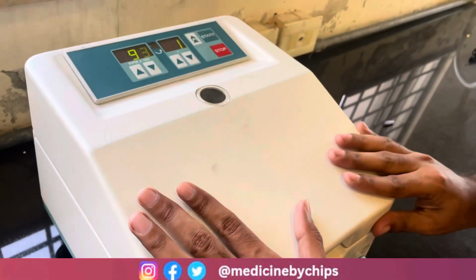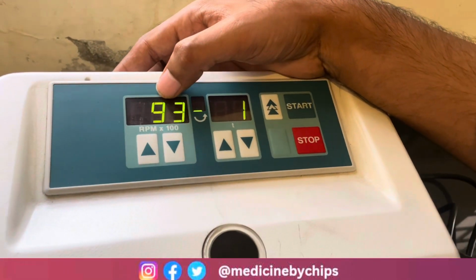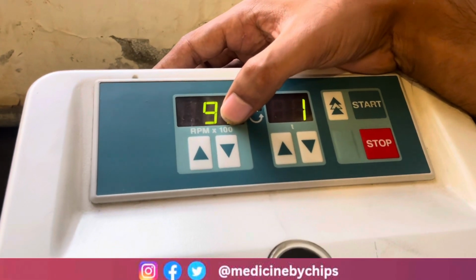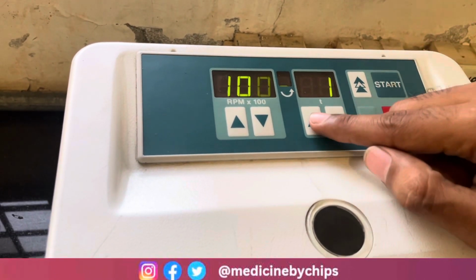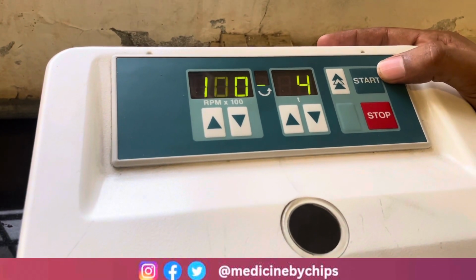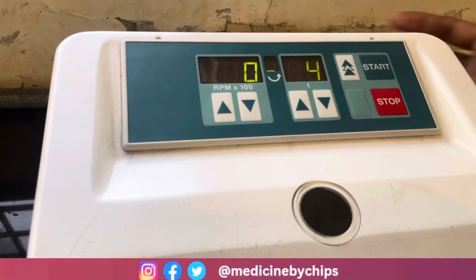Now we will start centrifugation. This is known as the rotation per minute. We will fix it at 10,000, which is given as multiplied by 100, so we will set it to 100. The minutes required are 4 to 5 minutes, so we will fix it at 4 minutes. This is the start button. If we push this button, it will start centrifugation, and after 4 minutes we will stop it. So, start.